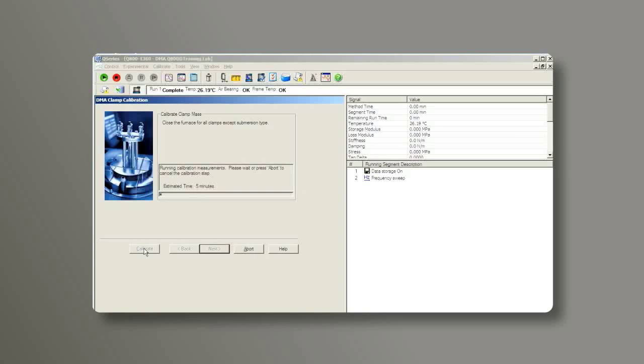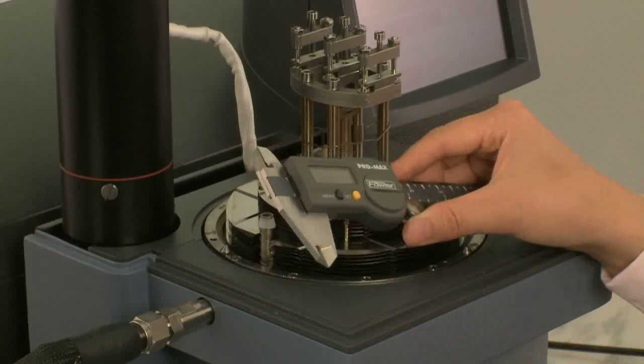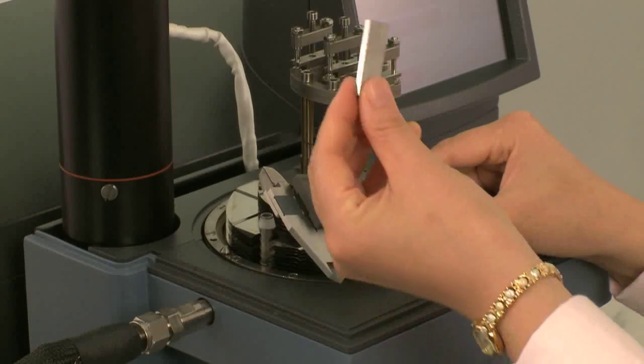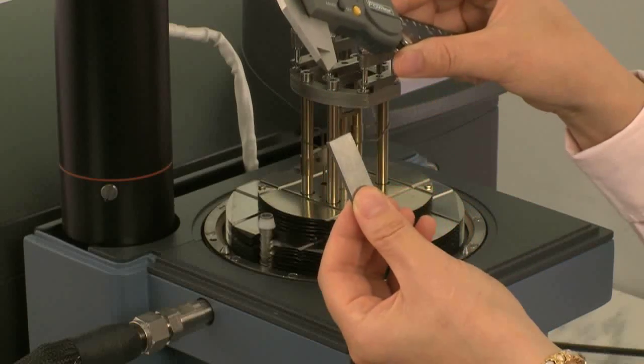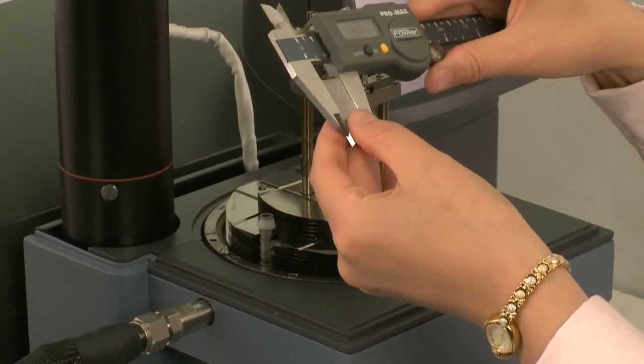This first calibration step is to calibrate the mass of the movable clamp. For clamp compliance calibration, take the stainless steel bar from the clamp kit. Use a caliper to measure its width and thickness.